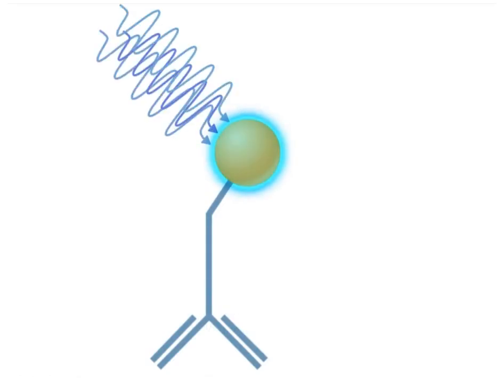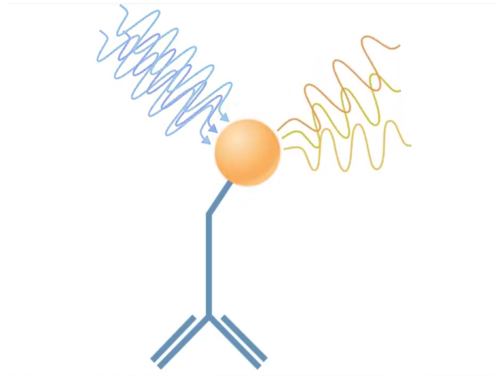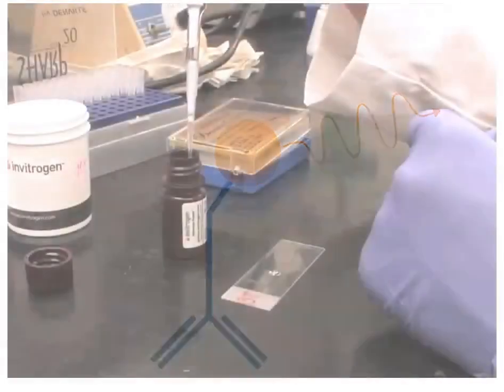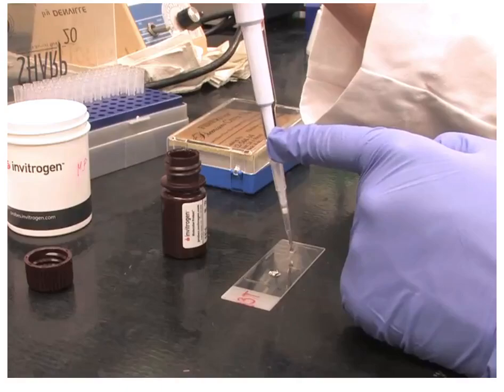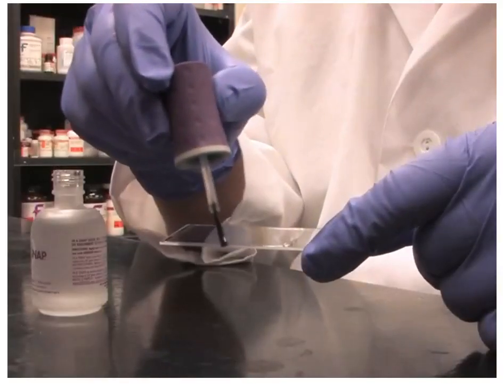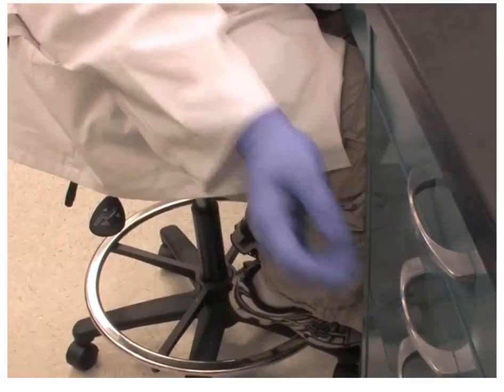Exposure of the fluorophore to prolonged excitation will cause it to photobleach, which is a weakening or loss of fluorescence. To reduce photobleaching, you can add an anti-fade mounting medium to the slide and seal the edges with nail polish. The slide should also be kept in the dark when not being imaged.